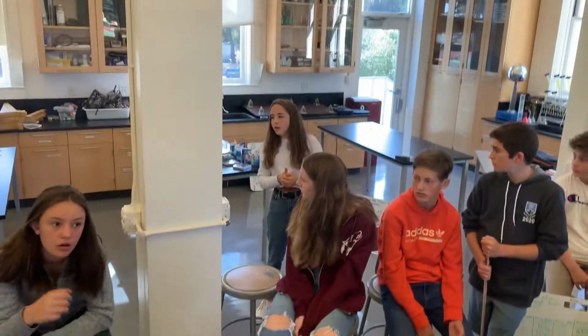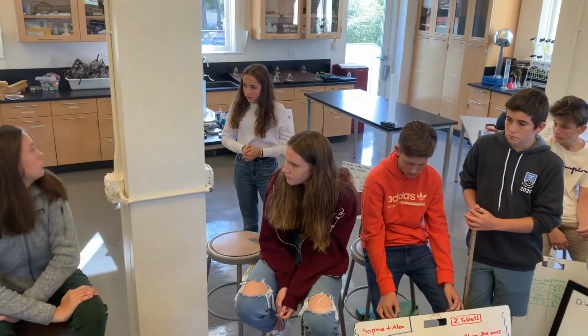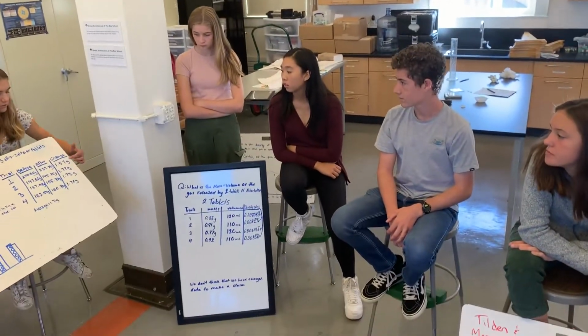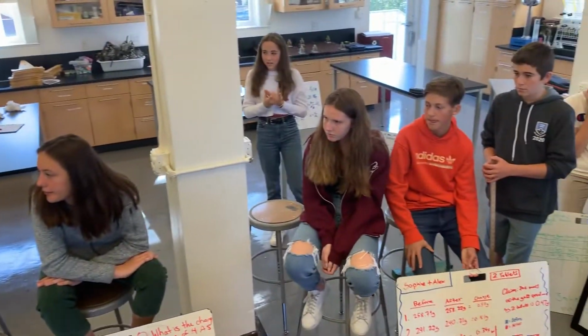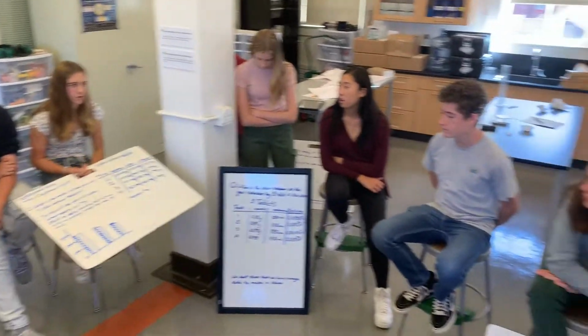How did lowering the water help with the final results? It made it more into the same range, because the first one was 1.57. Do you know why? It let less water escape, probably. Because the line was lower, there was more space in the beaker above, so less water could escape out of the top.